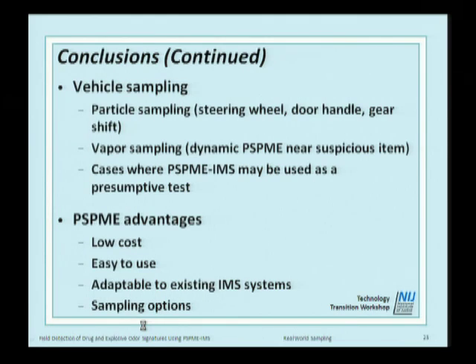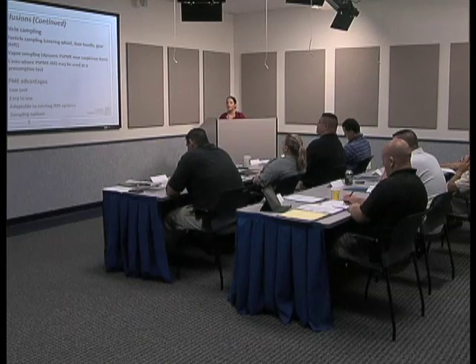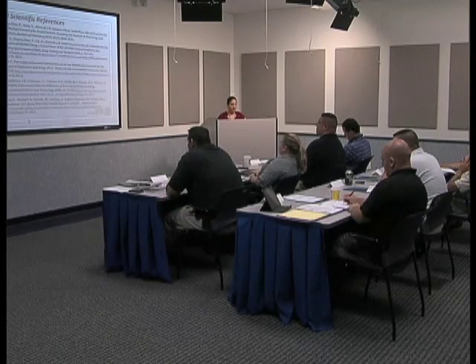And the advantages, again, of PSPME are they're generally low cost, and this is due to the fact that they can be used up to 100 times as long as you clear it out, blank it out. It's generally easy to use, as I think you experienced yesterday in the laboratory. And we can easily adapt them to the existing IMS systems that you have at your facilities currently. And you have different options of how to collect your sample.